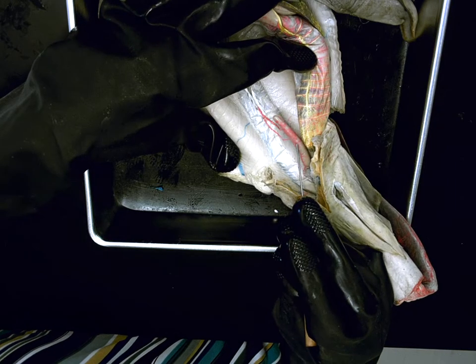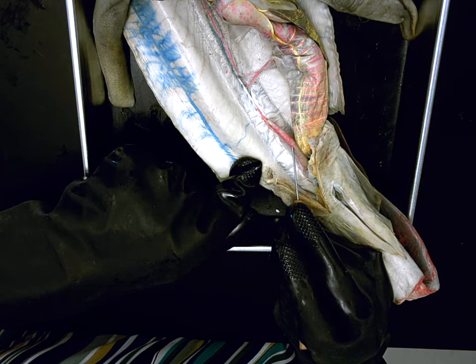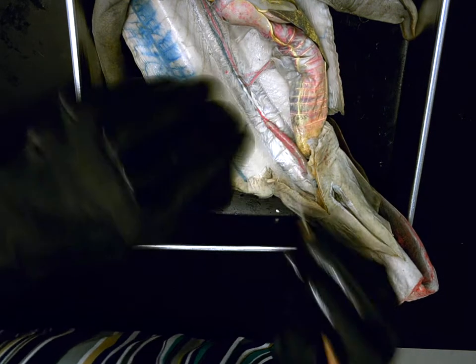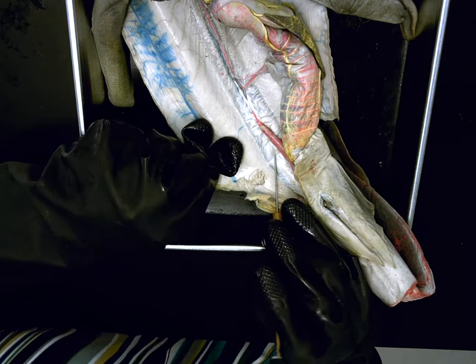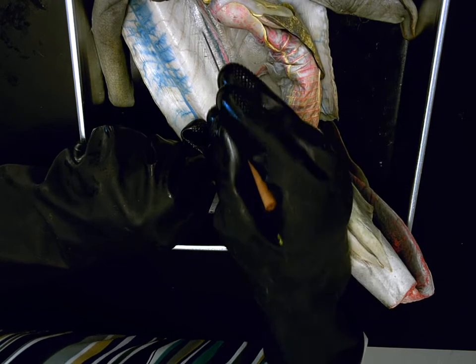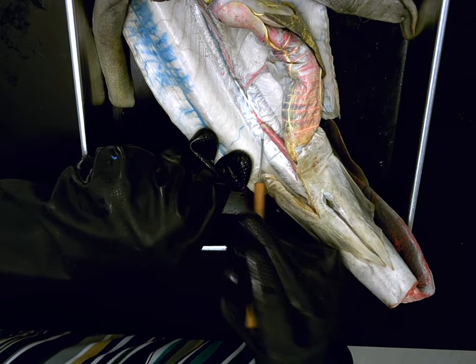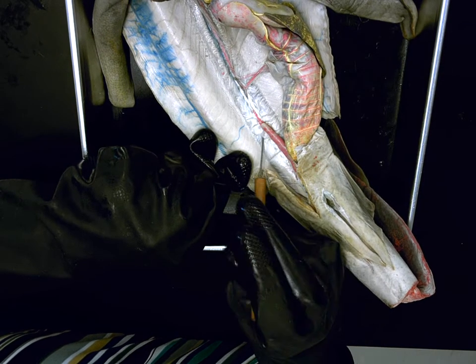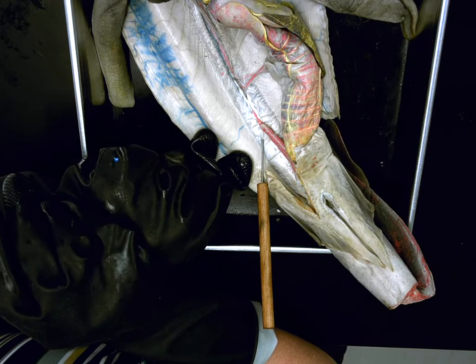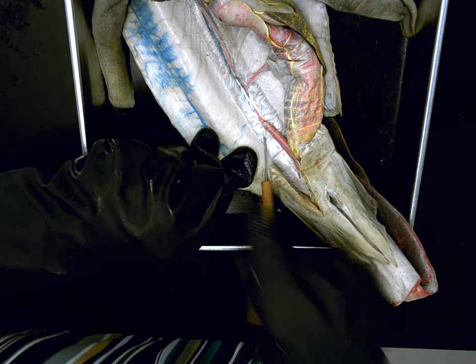Ashley, what is this structure that looks like a little hot dog? The rectal gland. And function. Responsible for removing excess salt from the blood. Excellent. Then if I go down here to the back wall, there's two of these. They're very long. They go the whole length of the wall. Kenny, what are these? Kidneys. Three functions. Remove excess water, excess salt, and metabolic waste. Correct.